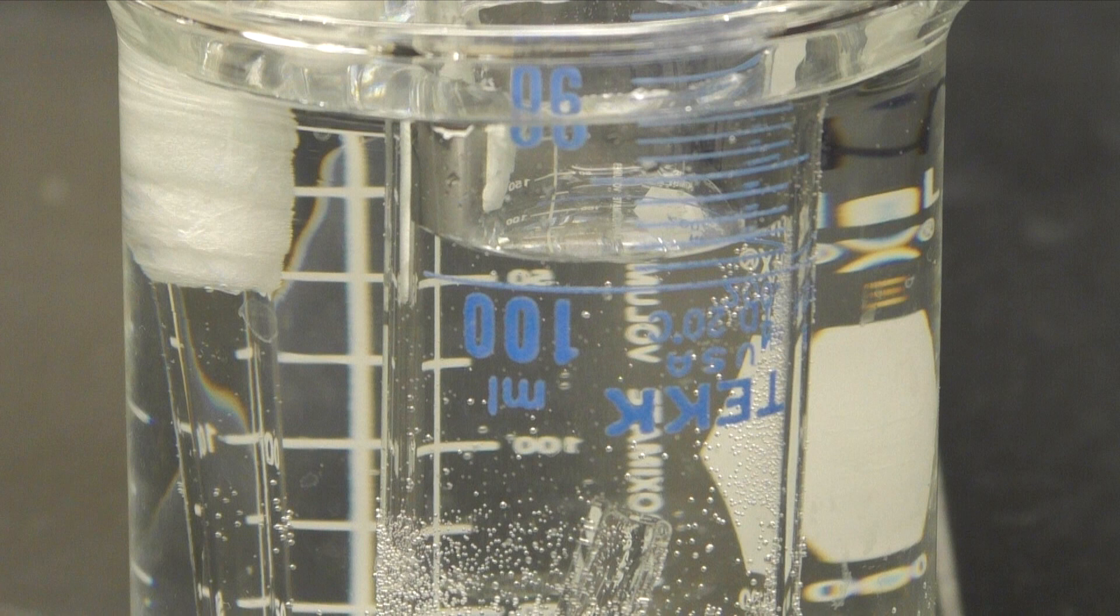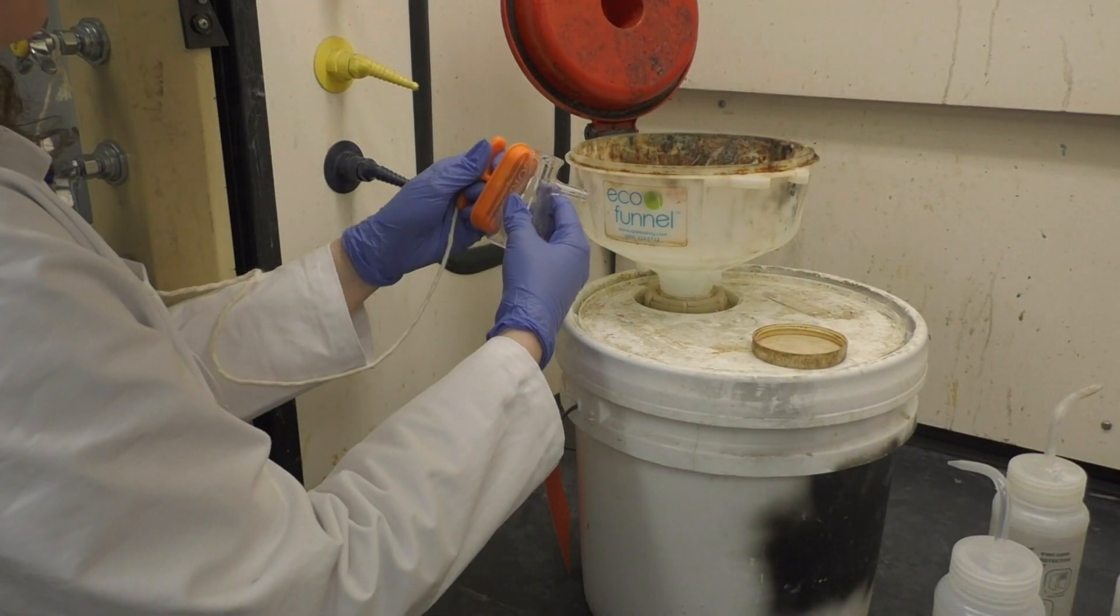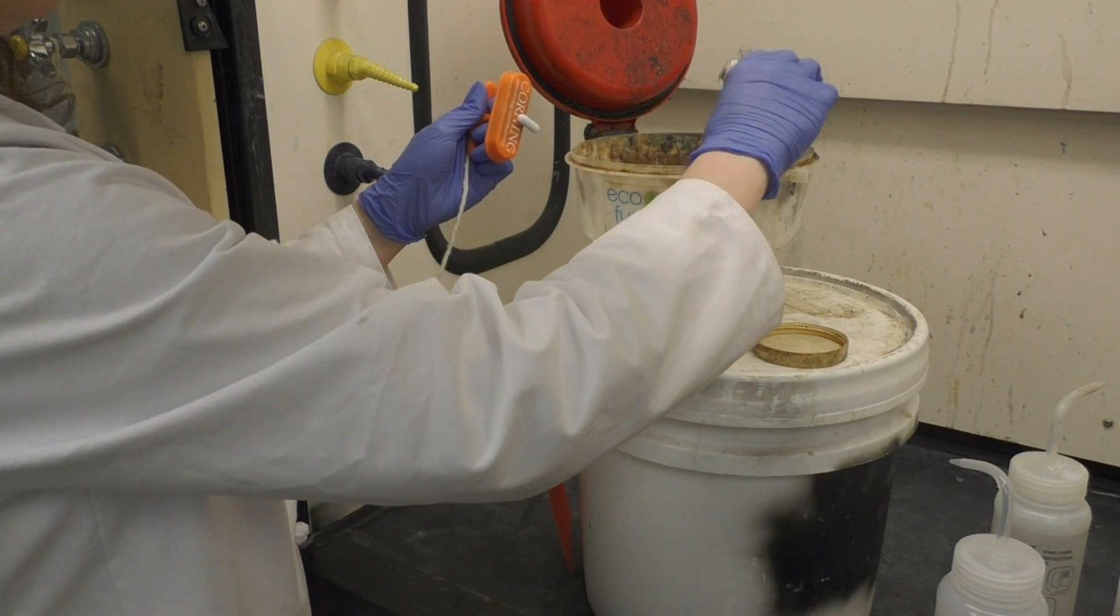When the reaction is done, be sure to record the final volume of gas in the graduated cylinder, and then disassemble the gas collection apparatus. Make sure you empty the waste from your filter flask into the liquid waste bucket, and be careful not to lose your stir bar.